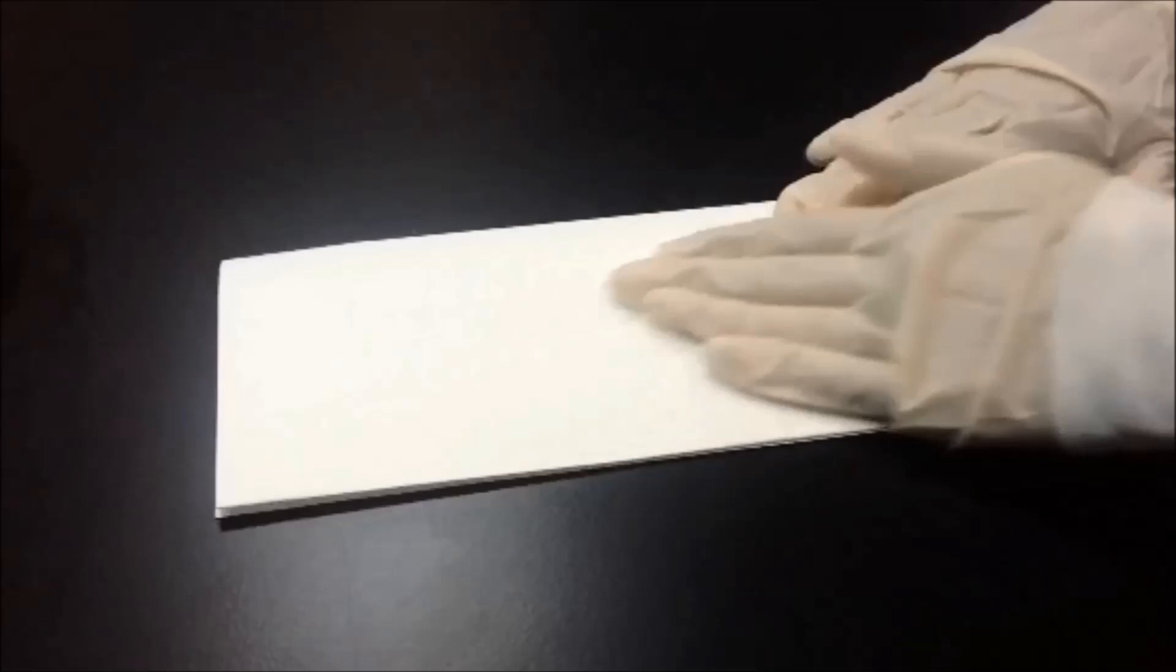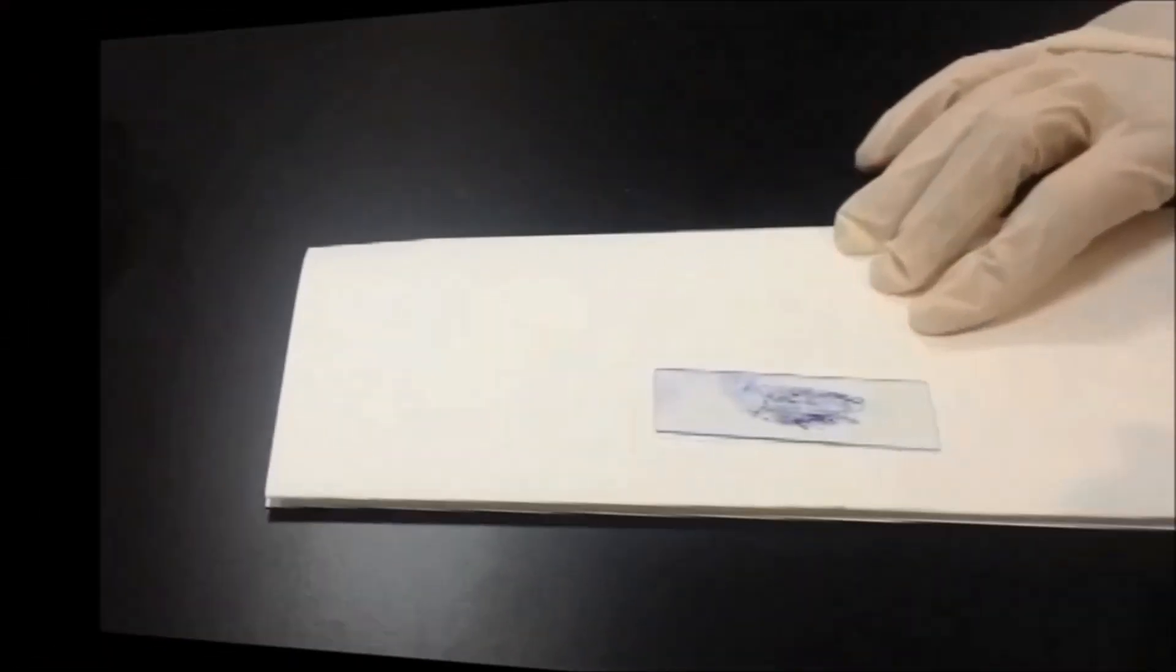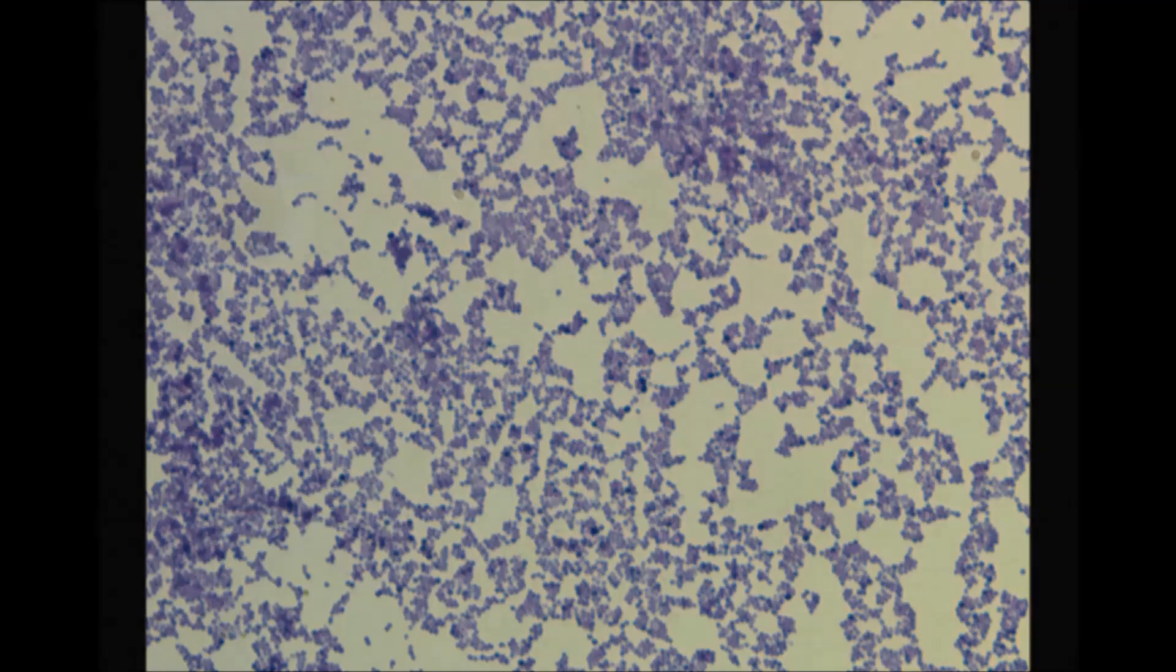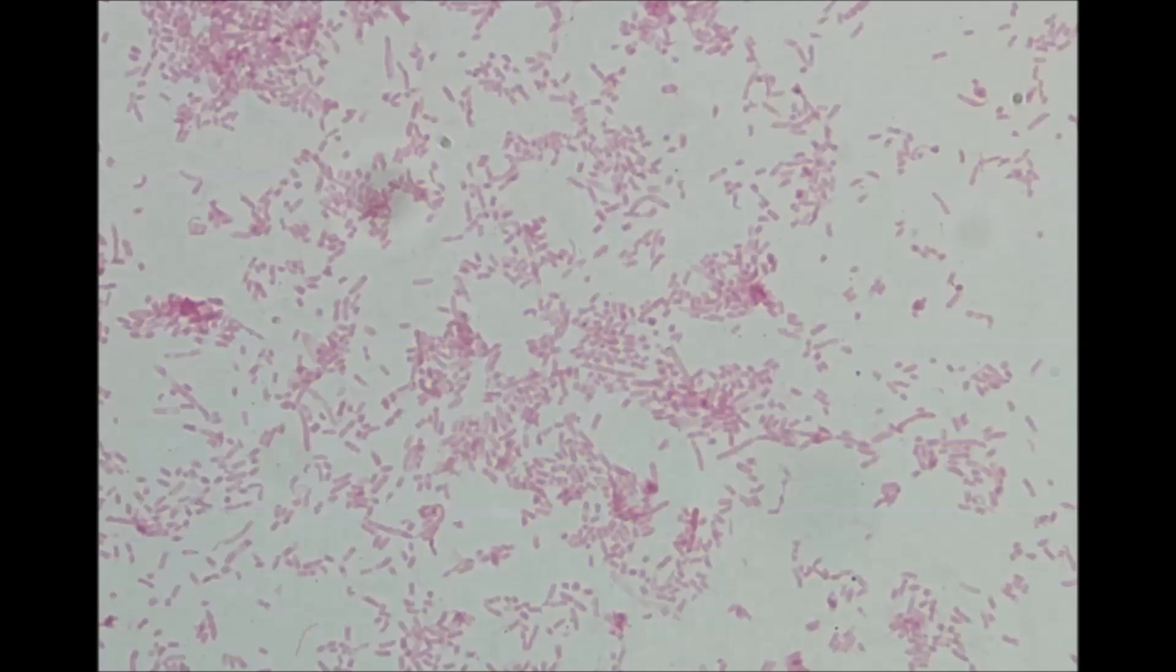Dry the slide gently using the dry blotting paper in your drawer. The slide is now ready to be examined under the microscope. Gram-positive organisms stain purple. Gram-negative organisms stain pink.